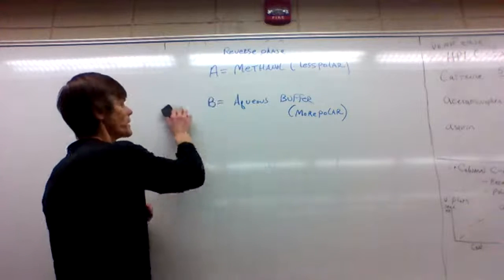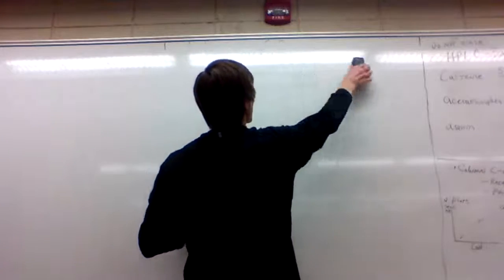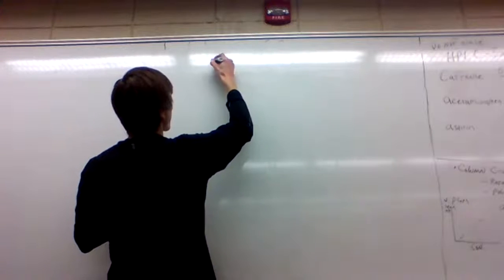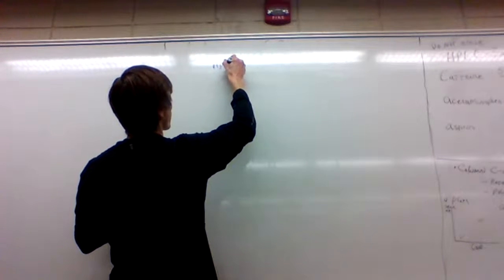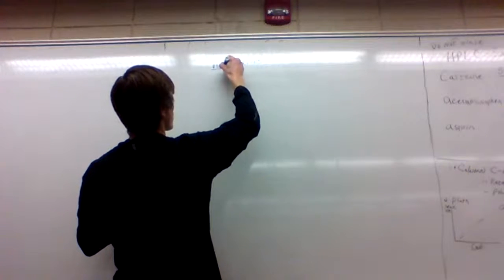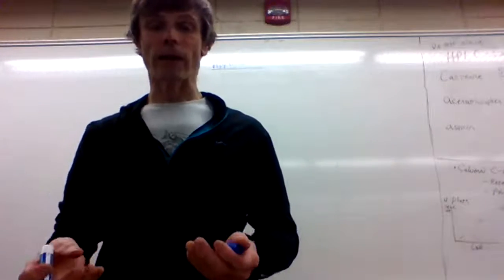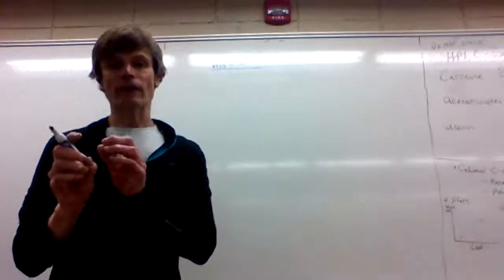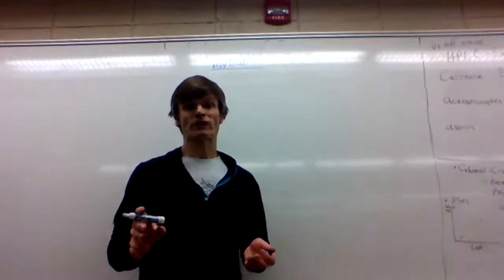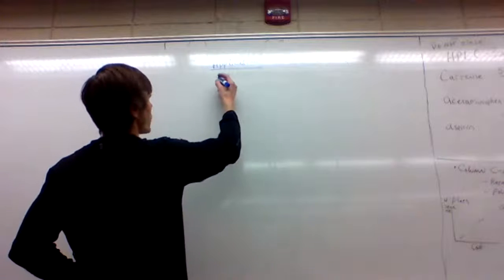The last topic, the final topic that we're going to discuss, is applications of chromatography. We can conduct qualitative and quantitative analysis. I think this is a quant class, but it's important to understand a little bit about some qualitative features. So let's think qualitatively.